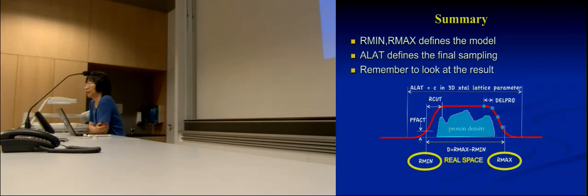Look at a few of your projects and understand what it's doing. So let's say, for example, I have data that's really sparsely populated. Then the fitting is not going to be very good. The program is going to give you, I think, an error bar of like 90 degrees or more. That's the case where it really doesn't have a fit, or you have a single point where the error is basically the whole thing.